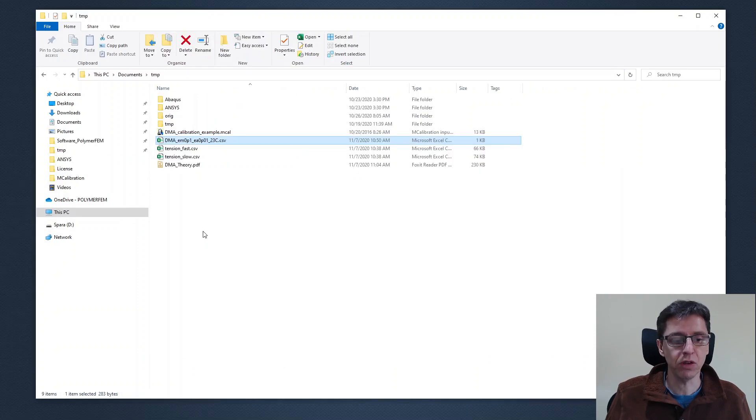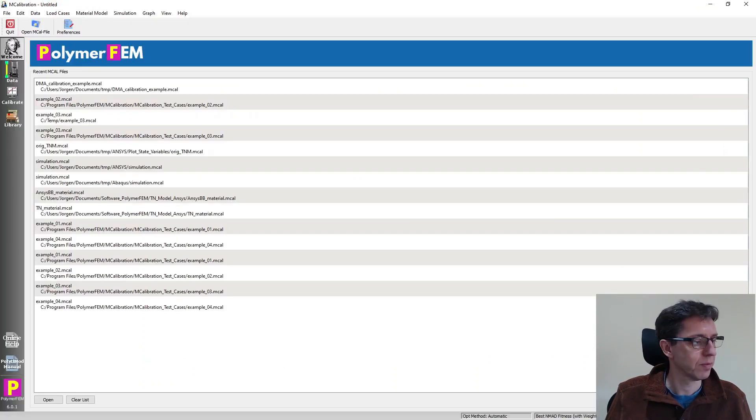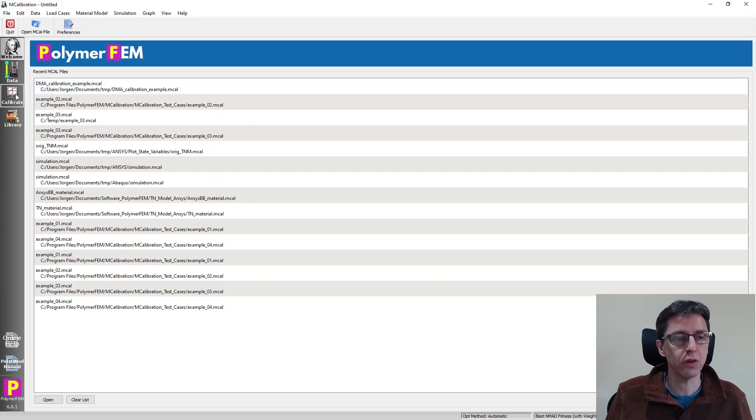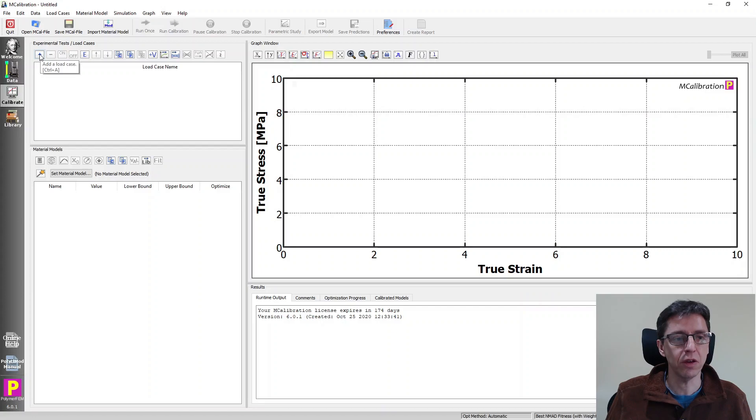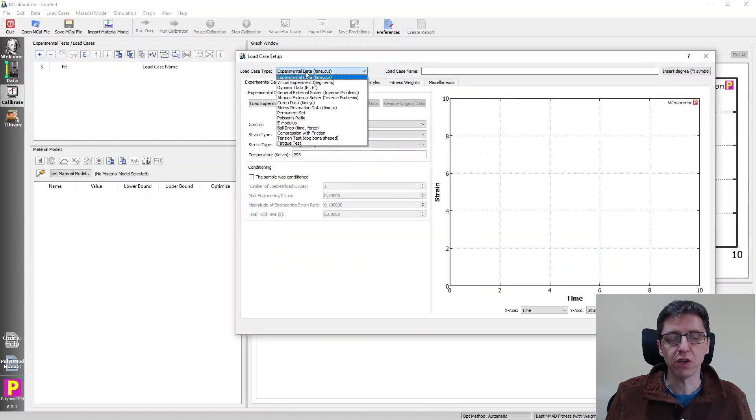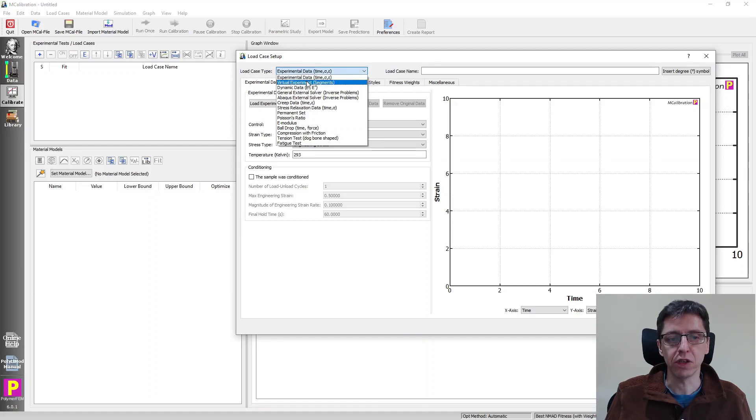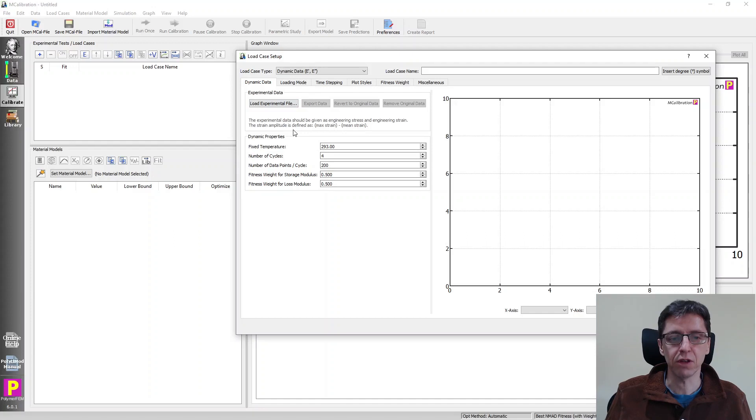So how would we use this? Well, I'm going to open MCalibration and I'm going to go to calibrate. I'm going to open a new test case load case by clicking on the plus sign here. I'm going to now switch from the type of data that we have from the experimental data to dynamic data, E prime and E double prime. So I select this one.